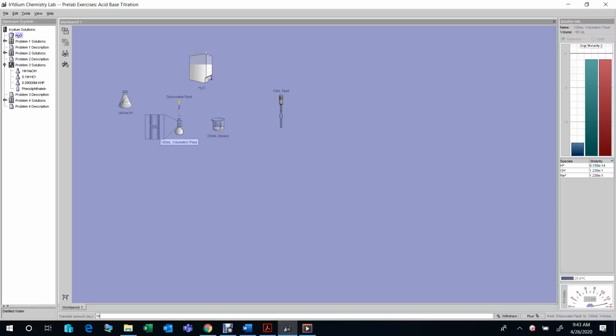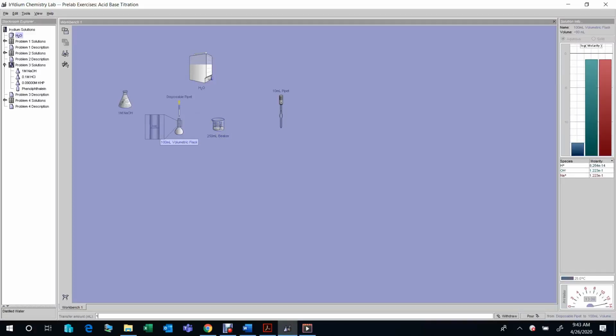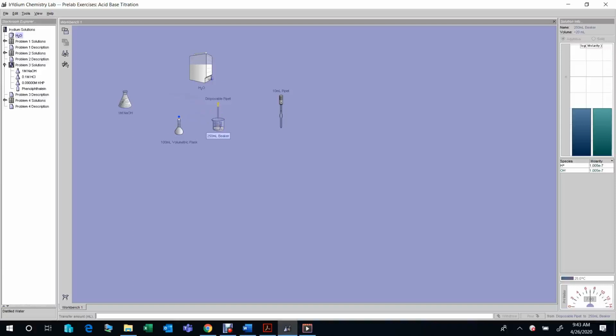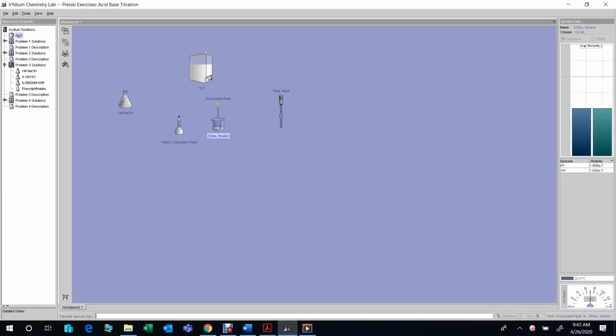1 milliliter. Okay, this part may be a little bit boring, but we have to do that so that we won't overshoot. Then we add 1.0. Then we withdraw, and then we do pour. Withdraw and then pour. Same volume. Pour and then withdraw and then pour.